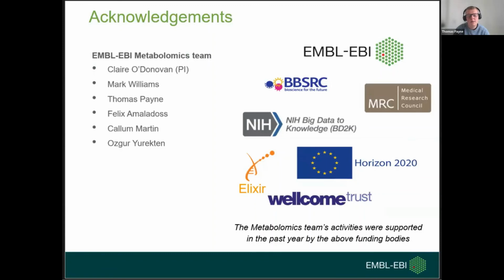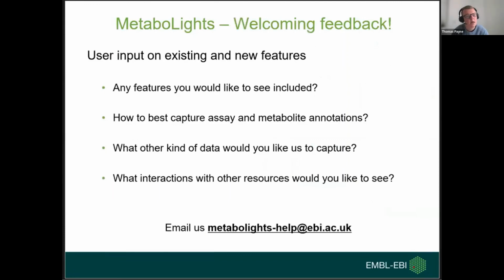We at the EBI Metabolomics team are a team of curators and developers, quite a small team. So please do be patient with us, and we are always welcoming feedback. So user input on existing and new features, any features you would like to include, how best to capture assay and metabolite annotations, and what other kind of data you would like us to capture, as well as interactions with other resources you would like to see. So with that, I'm happy to end and take any questions.